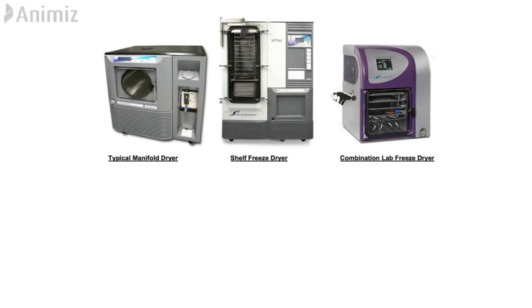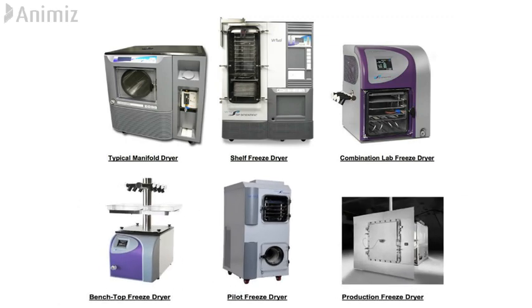Depending upon the design, they can be classified as manifold dryer, shelf freeze dryer or combination lab freeze dryer, and depending upon the capacity, they can be classified as benchtop freeze dryer, pilot freeze dryer and production freeze dryer.